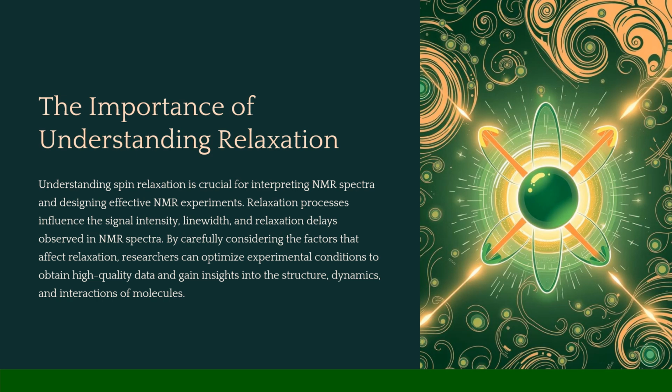Relaxation processes also provide valuable information about the structure, dynamics, and interactions of molecules. For instance, different relaxation times can reveal insights into how molecules move, how they interact with each other, and even how they respond to external influences like temperature or magnetic field strength.